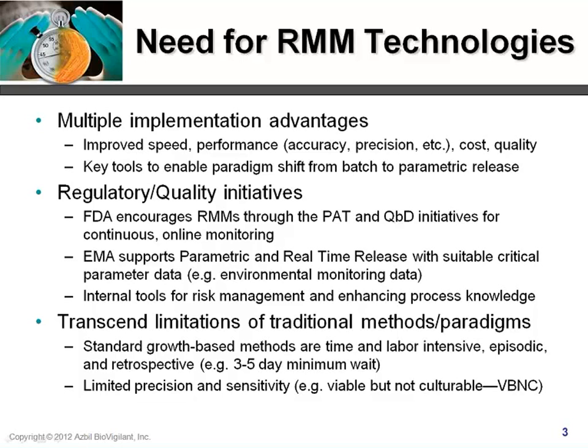Also, rapid micromethods have the ability to transcend certain limitations of your traditional growth-based micromethods. And a few of those qualities are that in certain cases your results can be generated in real time, instruments can be run continuously, and they do not require sample collection by an operator in the clean room, meaning it could be run remotely. Now, of course, this has the obvious logistical benefit of reducing the burden to collect and process environmental monitoring data, but it also has the added benefit of helping reduce clean room operator presence in the most critical areas where those samples need to be collected.